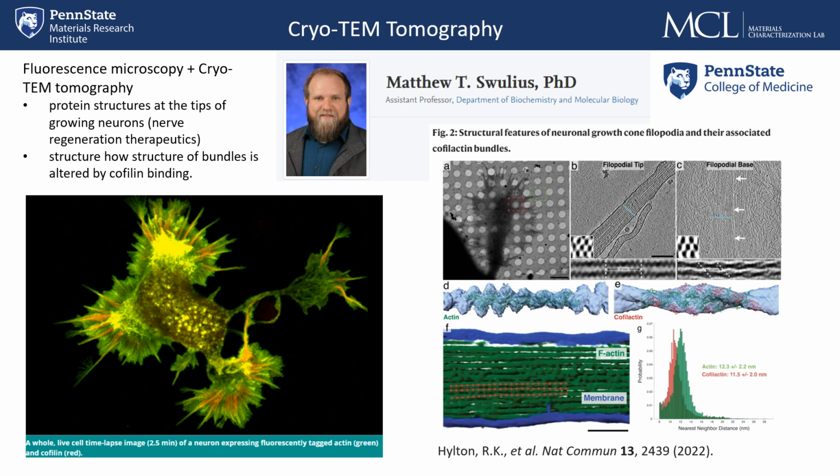Hopefully those are a lot of examples I've just shown you of doing tomography at different length scales, whether it's at the macro level with the X-rays, or the micro level with the SEM, or down to the nanoscale with the TEM. And what's really cool is when we can combine those different length scales together by identifying our region of interest at a larger length scale, drilling down and getting more microscopic information with either the SEM or the TEM that's going to tell us a lot more about what's going on in that sample.